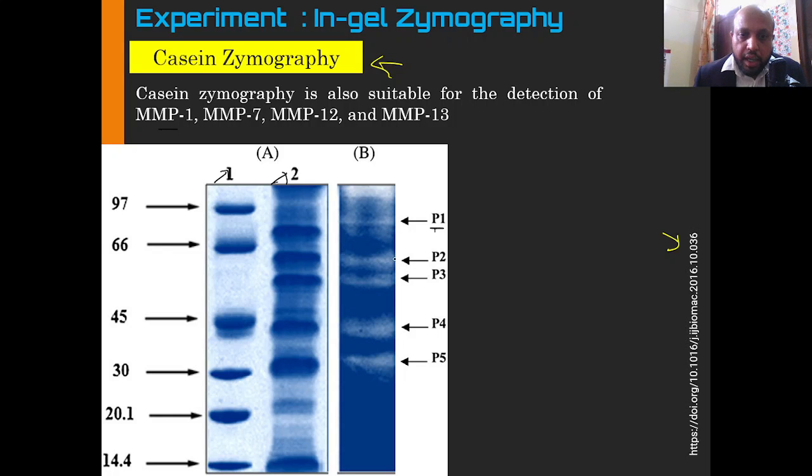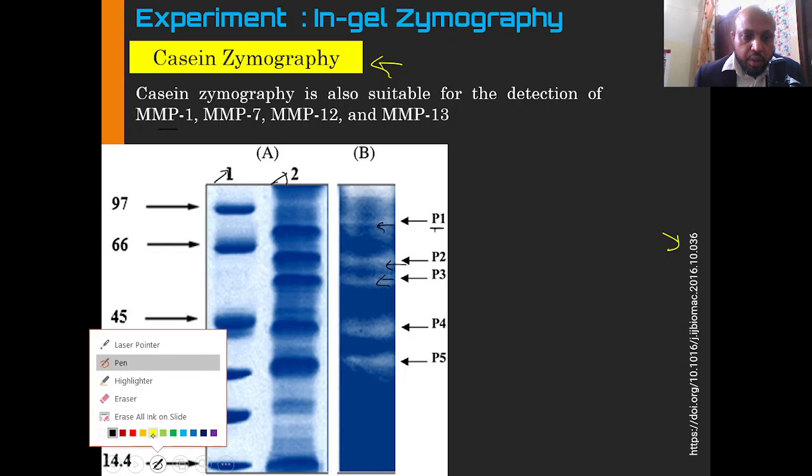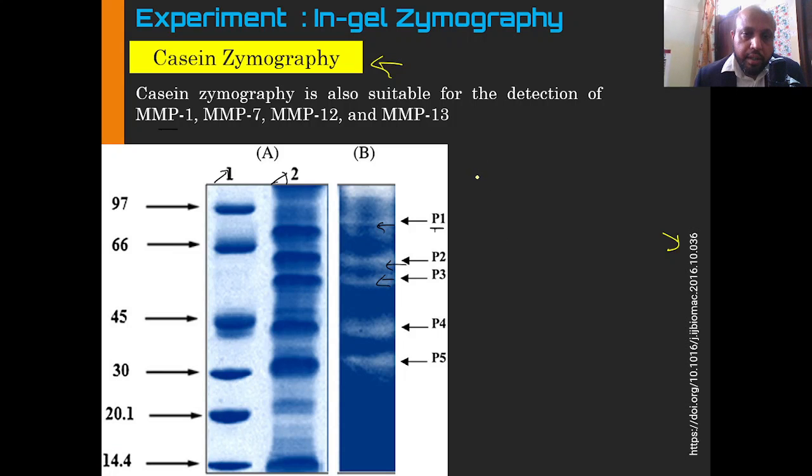So you can see clear bands like this. Okay, these are the bands, as you can see, and you can differentiate them in the gel. So the advantage here, as I said, is that different isoforms can be found. You can differentiate between a zymogen and another zymogen, and the difference here is that you use a non-reducing condition.